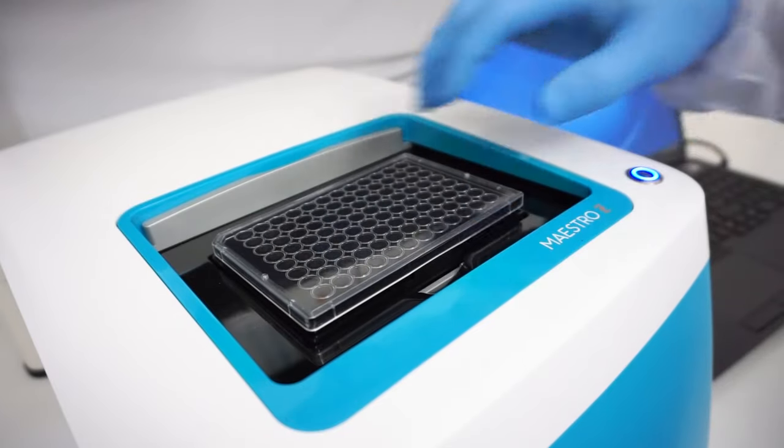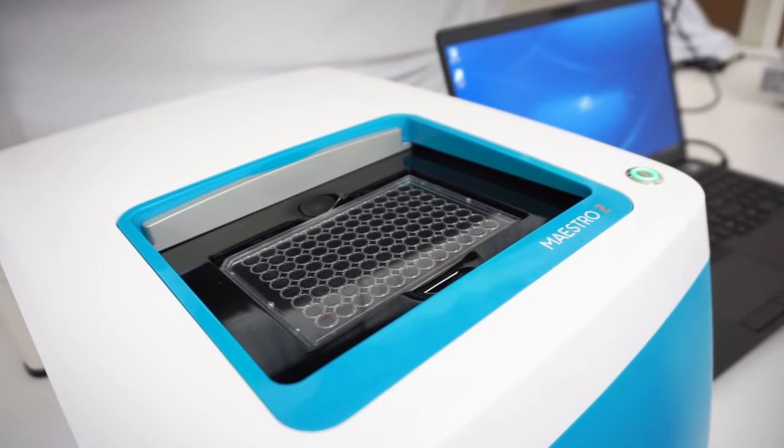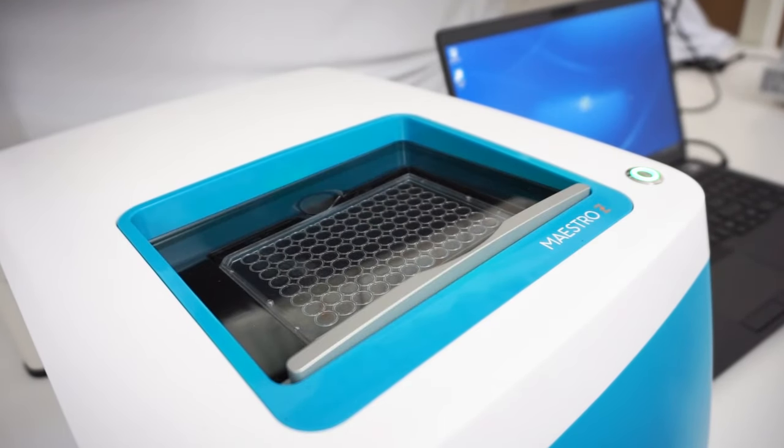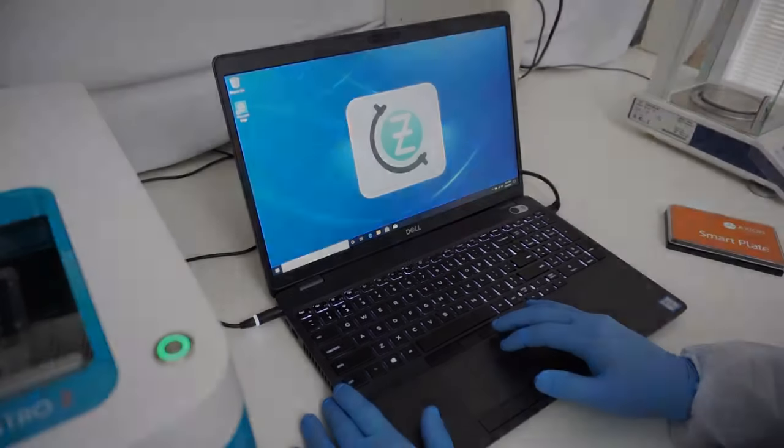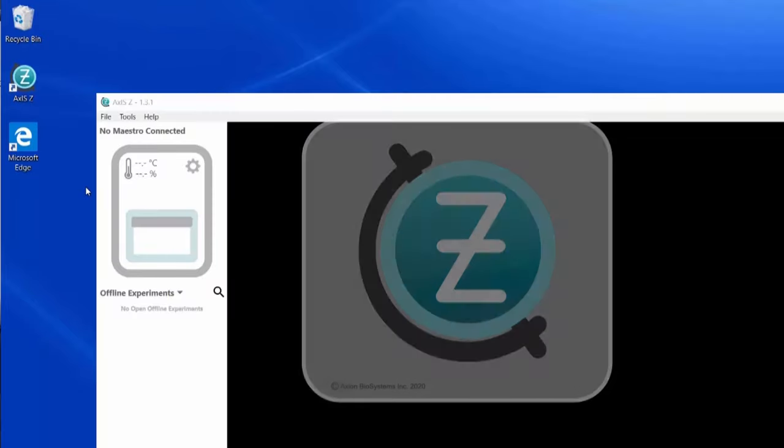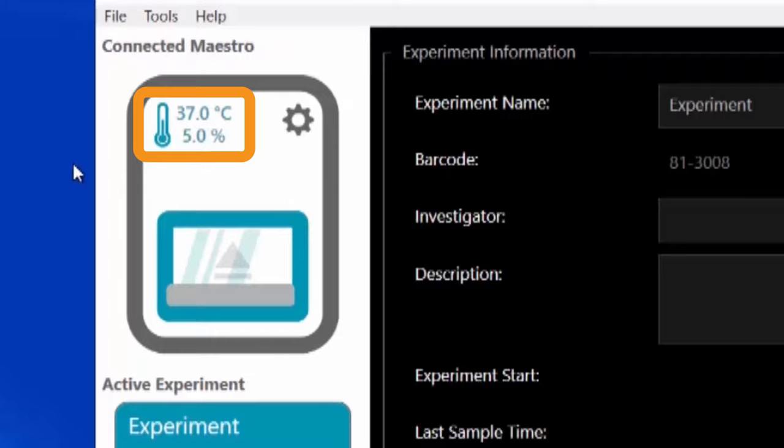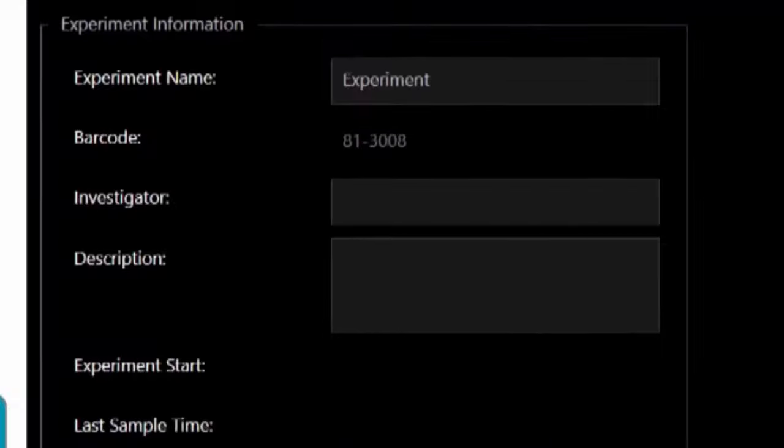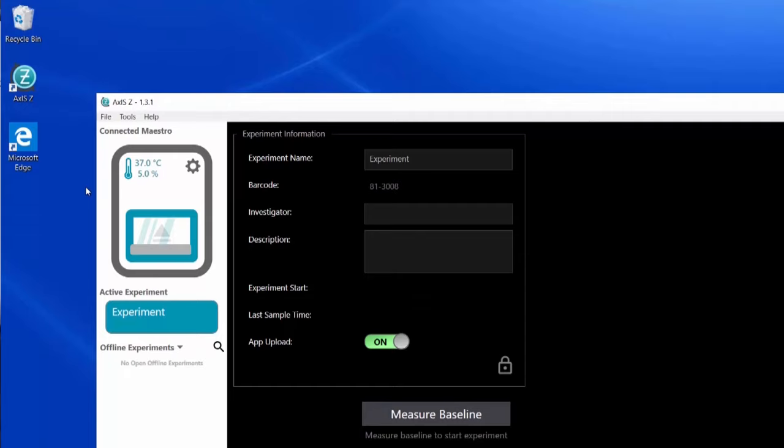The Maestro Z will now automatically perform the rest of the system setup. Temperature and CO2 levels automatically adjust on plate docking and data collection starts. Plate usage is also logged via an integrated plate barcode scanner for convenient experiment tracking.